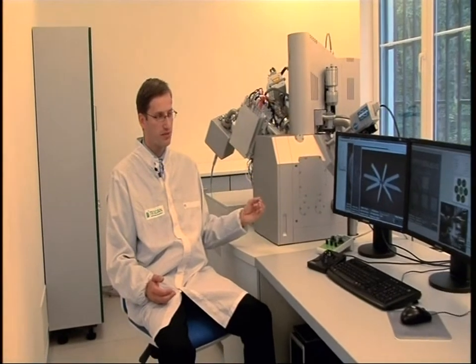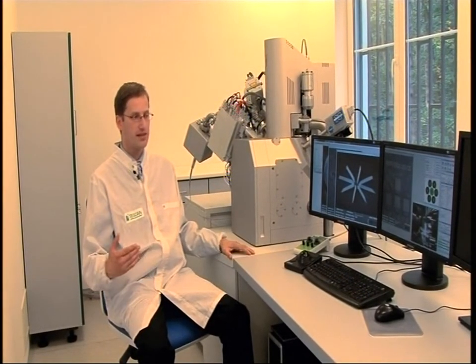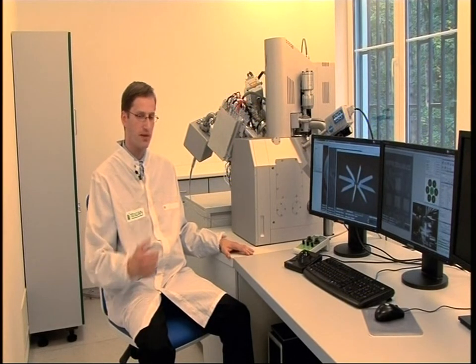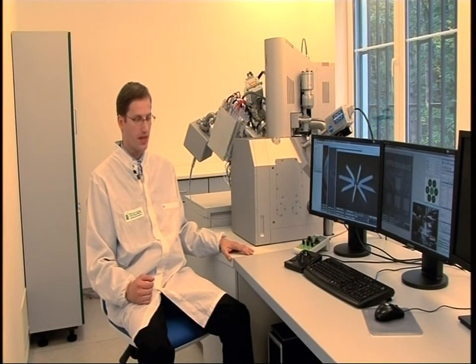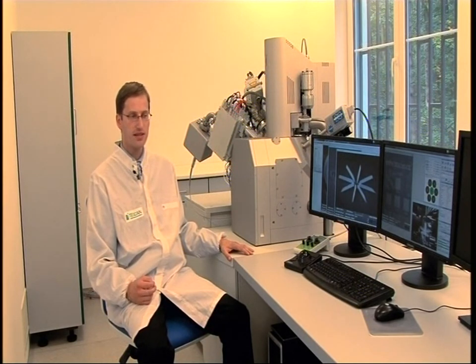In this way, using a combination of all of these devices, we make a scientist's work much more comfortable. Additionally, using a combination of these tools, new things that were not even possible before can be done now.